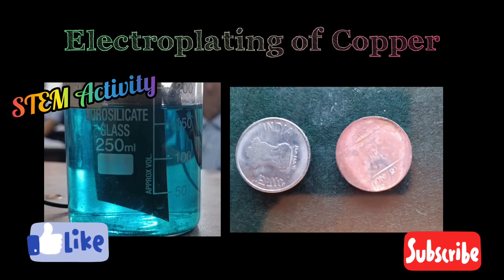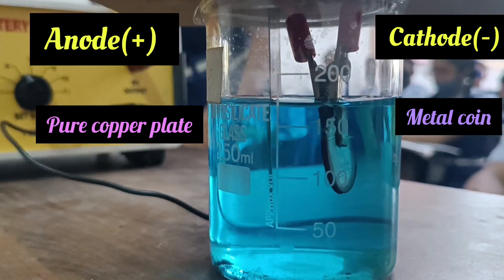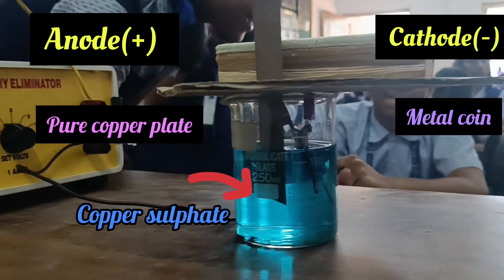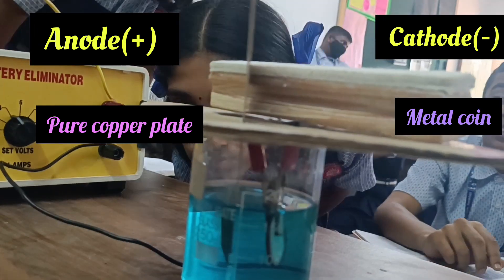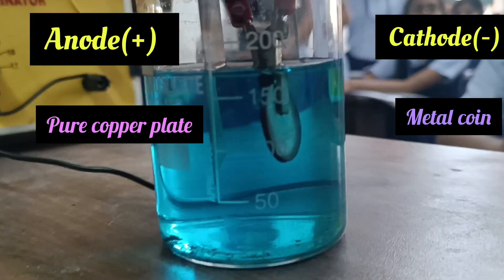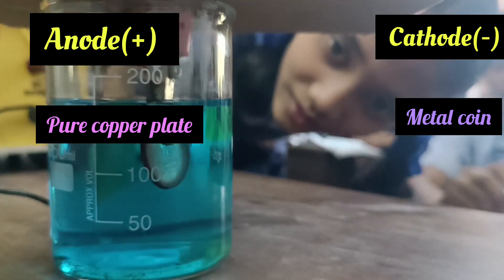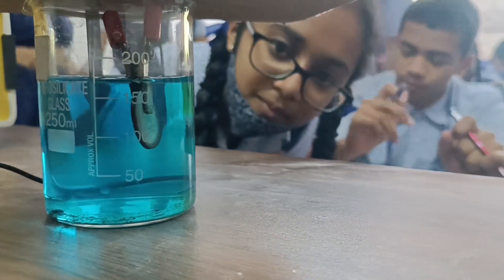Hello students, let us understand the process of electroplating of copper with the help of this activity. We have taken an electrolytic cell in which we have taken copper sulphate solution as an electrolyte. To the positive terminal of the battery we have taken a pure copper plate, and to the negative terminal of the battery we have taken the metal coin. The process of depositing a desired metal over a metal object using electric current is known as electroplating.